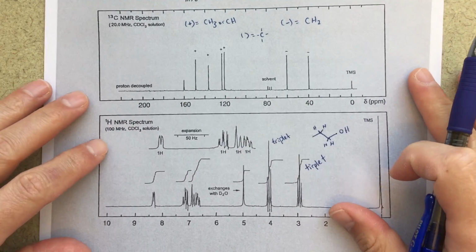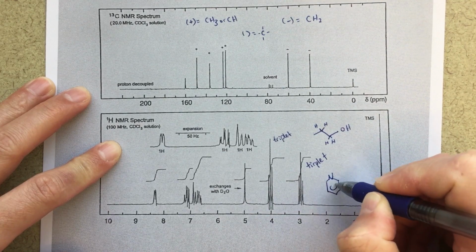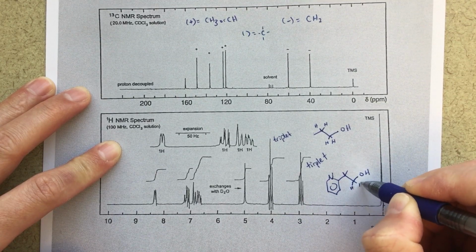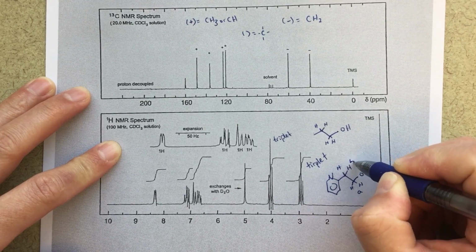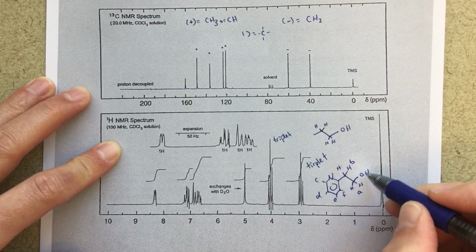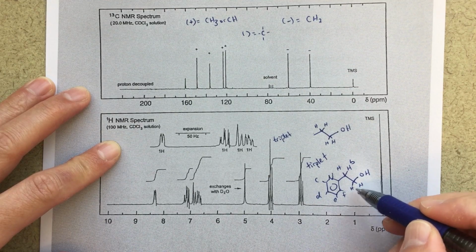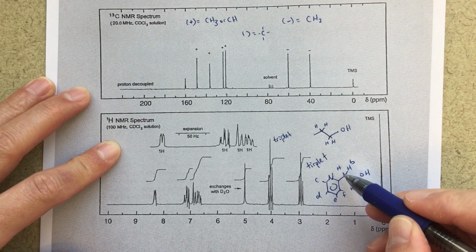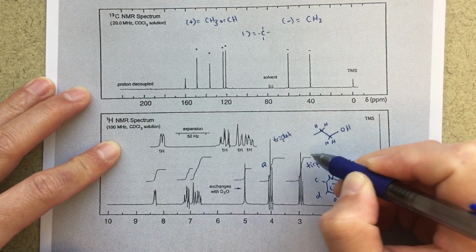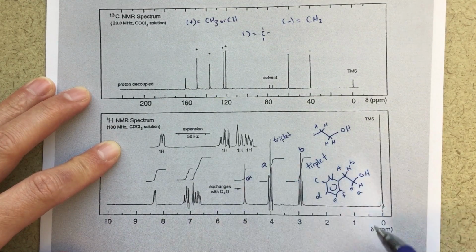So maybe we'll redraw our structure right here. Nitrogen, OH. We'll label these protons as A, these protons as B, then we'll go C, D, E, and F. So A, oh, we forgot our OH, but it's right there. Our A protons are going to be further downfield than our B protons because of the proximity to the OH. So I would call these our A's, these are B's. We didn't label our OH, but that's going to be our OH.